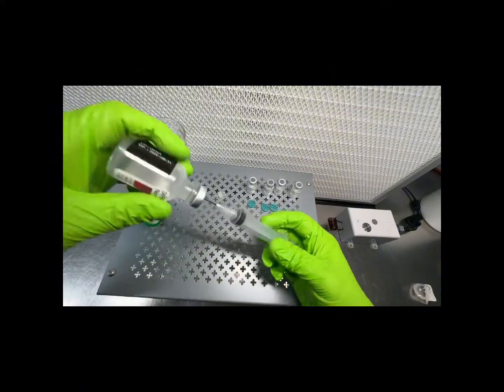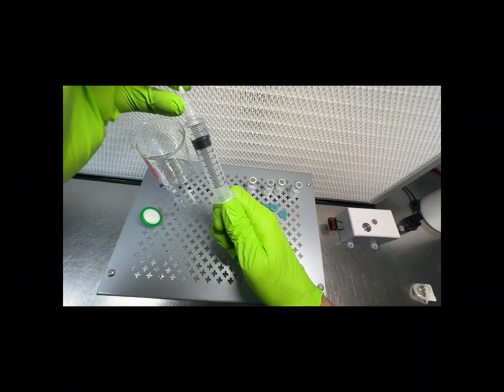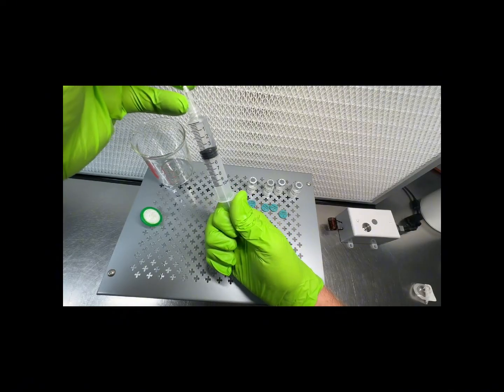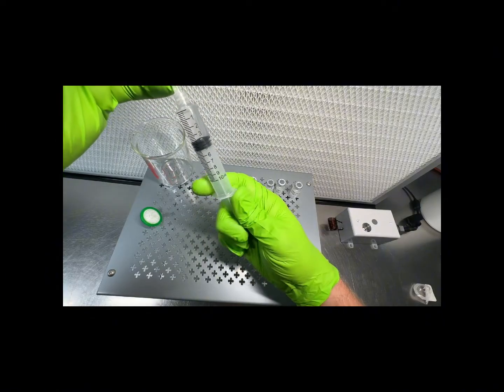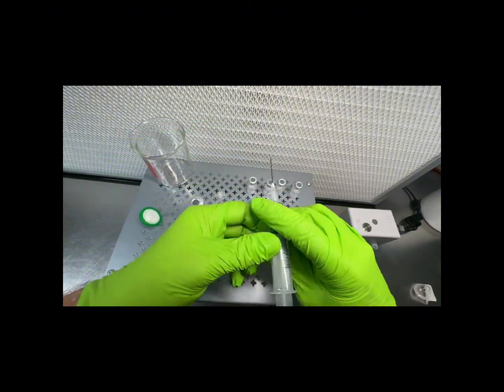So the first thing I'm going to do is reconstitute each of these vials with 1 milliliter of bacteriostatic water. So I'm going to go just a hair over here. Okay.